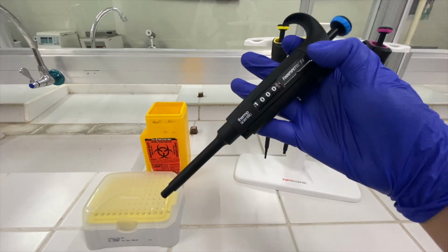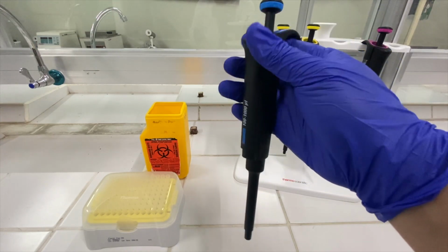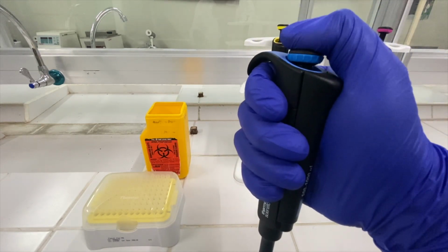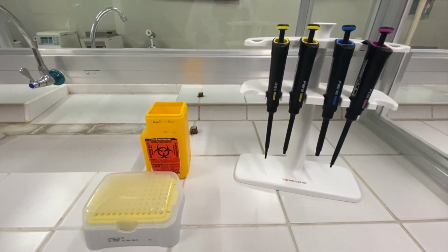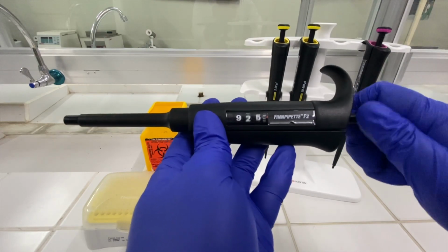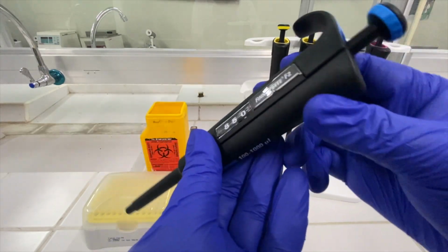Also, we have two pressable parts in this type of micropipette, the plunger and the ejector button. Most brands have actually manufactured the plunger as the adjustment knob as well. So in setting the desired volume of the micropipette for a particular procedure, just gently rotate the knob, and at the front of the pipette, you can see the volume indicator.